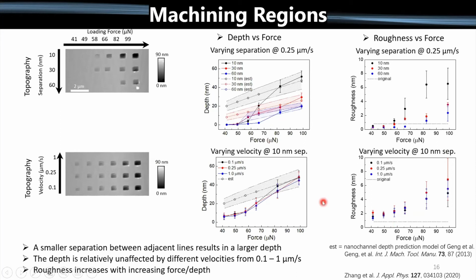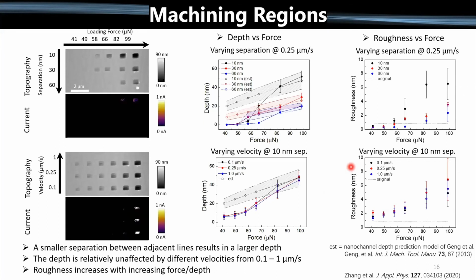And this highlights that there are certainly different regimes in tomographic measurements of ferroelectric materials, where you can have a material removal, a plowing regime, and you can also have a polishing regime where you're removing just a limited amount of material at a time. And that's probably most suitable for the tomographic approach for imaging ferroelectric domain walls as a function of depth.